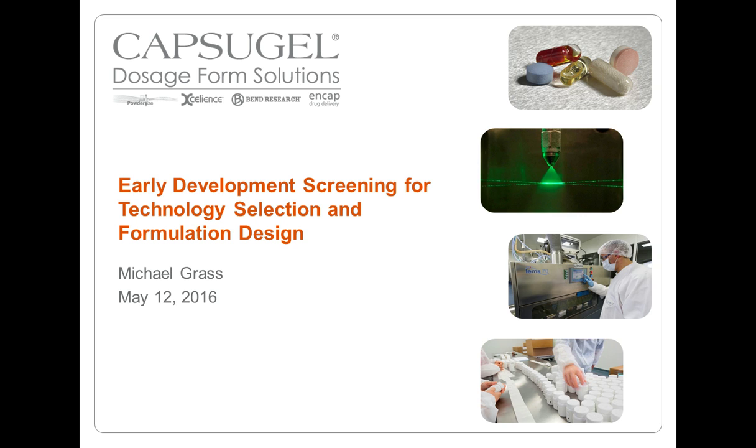Thank you for the introduction, Stephanie. Again, I'll be focusing today on early development screening for technology and formulation selection, with a particular focus on spray-dried dispersions.